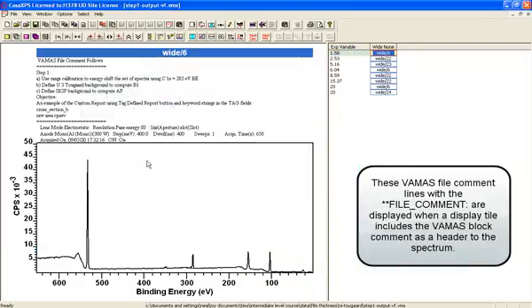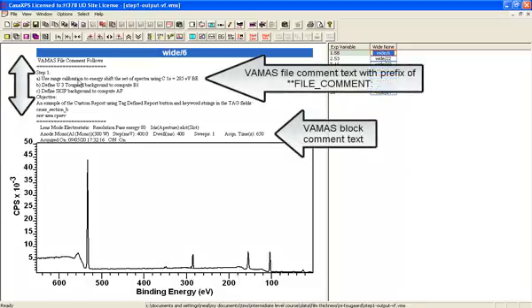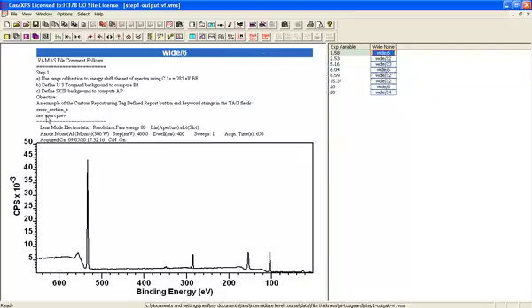This shows us that this file has been prepared and documented to have a range calibration used to shift the energy, a U3 Tugard background to compute the B1 value, a skip background to compute the AP value. The objective is to show that we're going to use the custom report to calculate values using these two keywords.